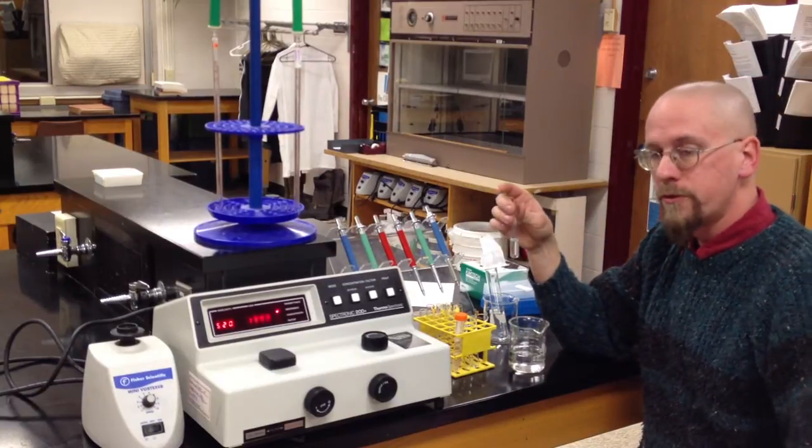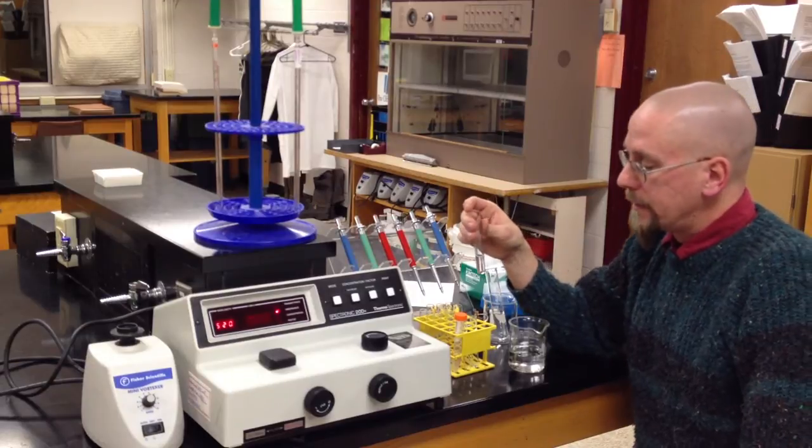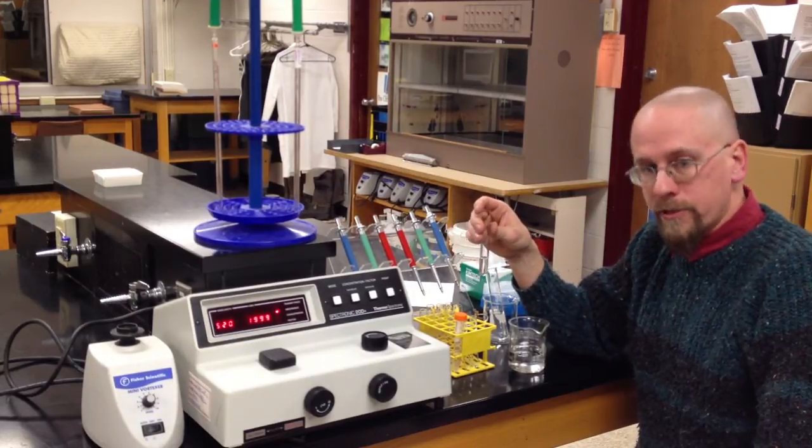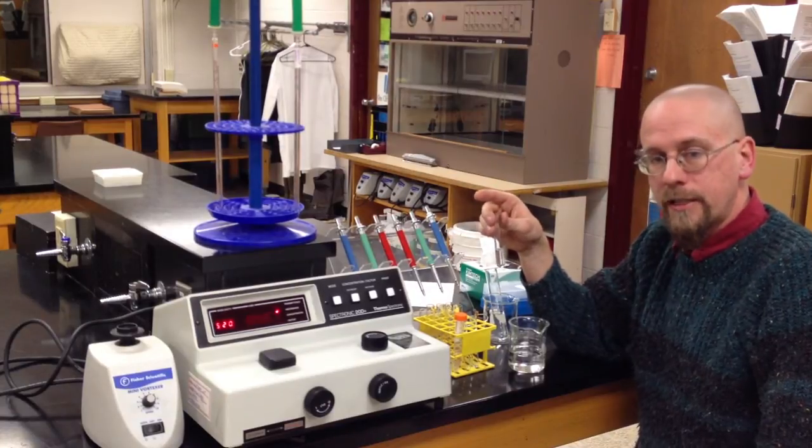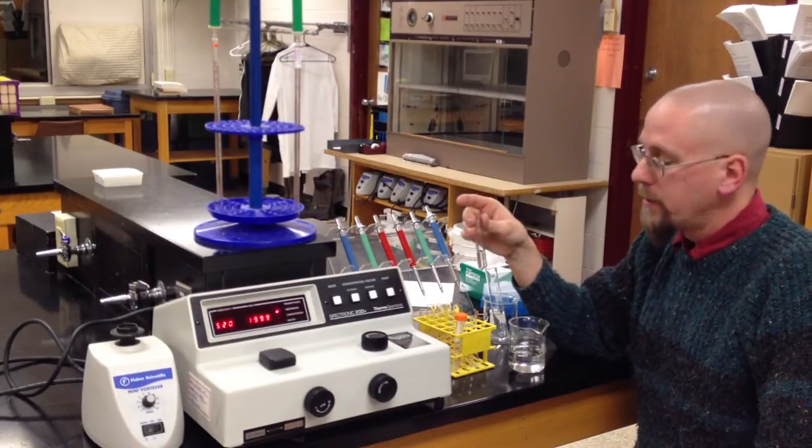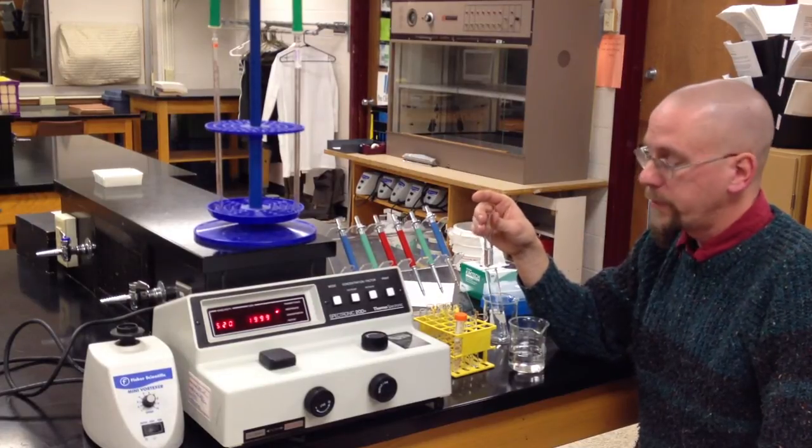You're going to want to do everything that you can in these experiments to make sure that you have accurate volumes. That's why we're being particular about the instruments we use and the methods we use. The more you work on this to get consistent, the better your results will be.